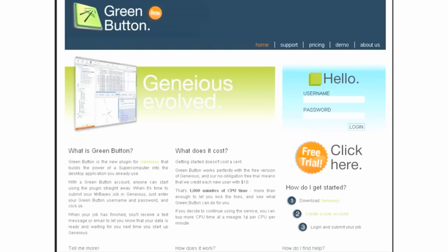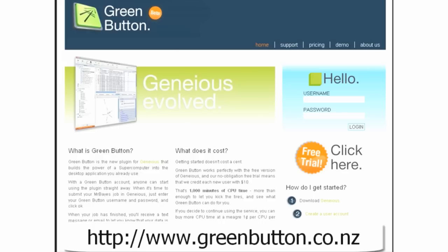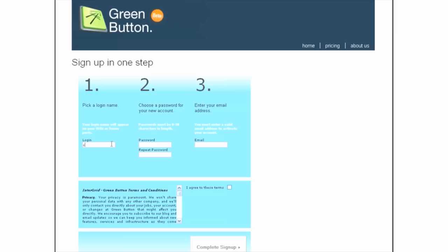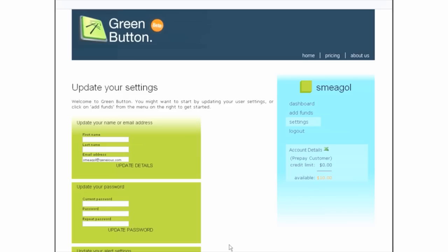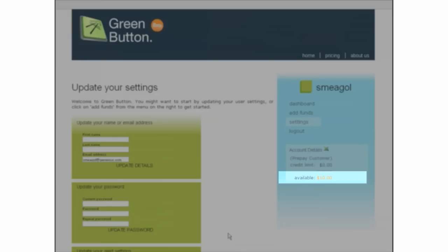To get started with the Green Button, you first need to create an account on the Green Button website. To do this, go to greenbutton.co.nz and click the Free Trial button. Enter your details, click Complete Signup, and you will even receive $10 credit free for a limited time. That's enough to get you 16 CPUs for over an hour.